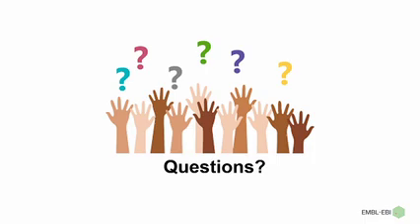Thank you, very interesting. Does it mean that we can also have access to all the current and previous data repository records in an integrated fashion? That's a good question, and it has been discussed. Metabolomics Hub datasets will have updated requirements, but in the portal we plan to enable one option that will allow people also to look for older data sets, what we call legacy data sets.